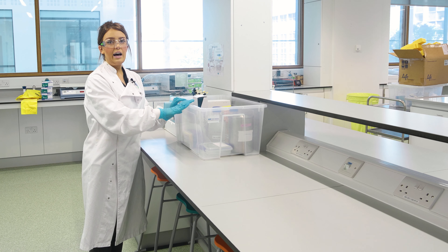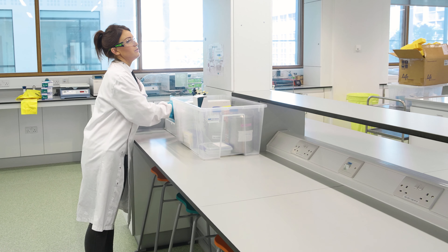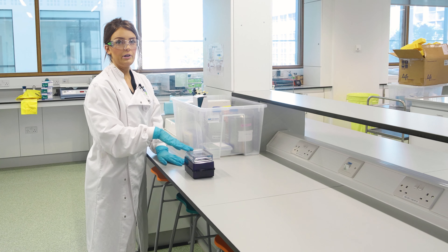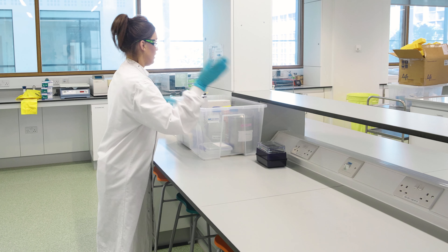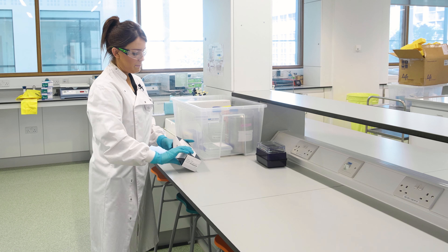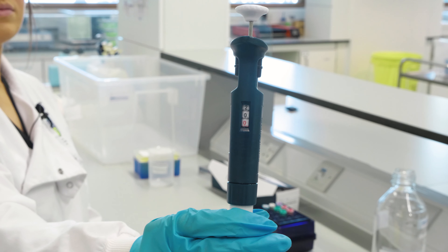For this lab, students will be in groups of three. Per each three students, you'll give them the DNA samples in the blue cooler box, which will be in the freezer until you need them. You'll give them a p20 pipette that will be set to 20 microliters.